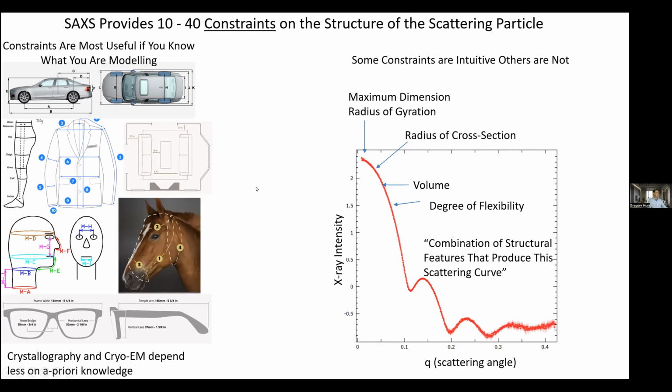So having a homolog, and obviously I'm heavily hinting, and we'll get into this in a bit, AlphaFold 2 is one of those things that you can start messing with. Some of these constraints you can immediately make connections to with real physical things, right?